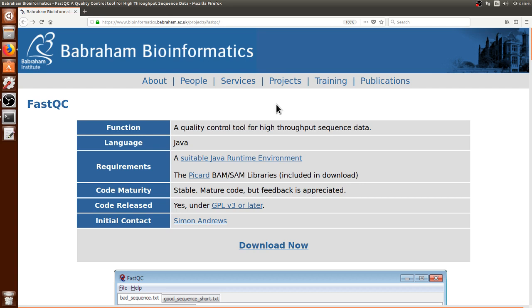Hello, my name is Daniel, and in this video I will show you how to use the algorithm FastQC through a terminal using a computer cluster.